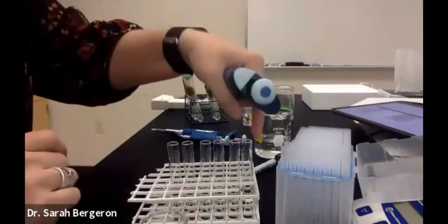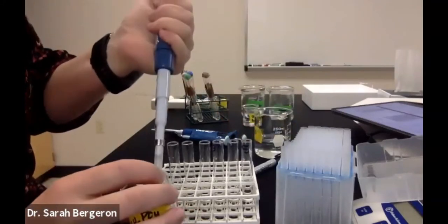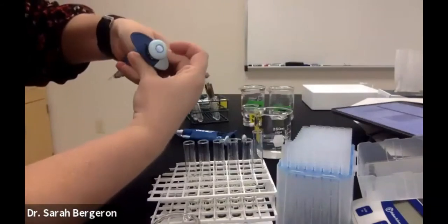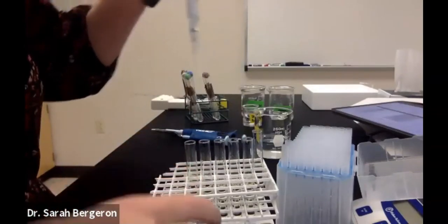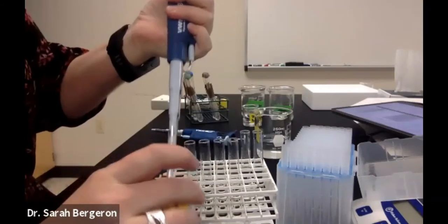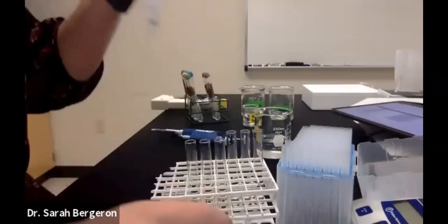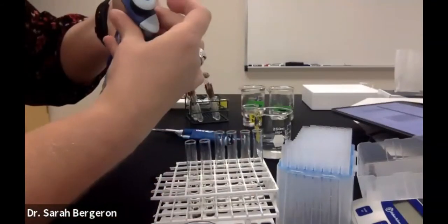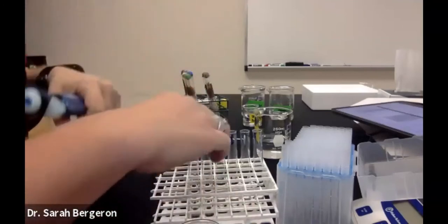So the first one I'm going to do is my maximum, because that one is the 5 micrograms of phosphate, which is 500 microliters of solution. So I'm going to go ahead and add that one. 400. 300. 200. 100. And the last one gets none.